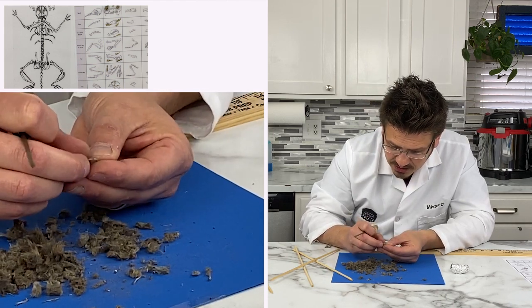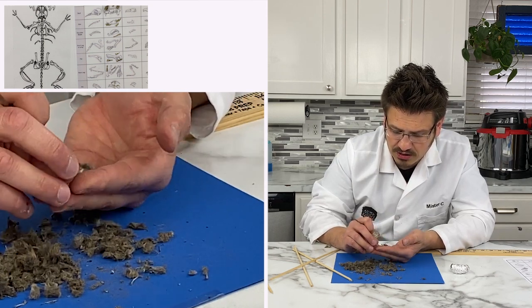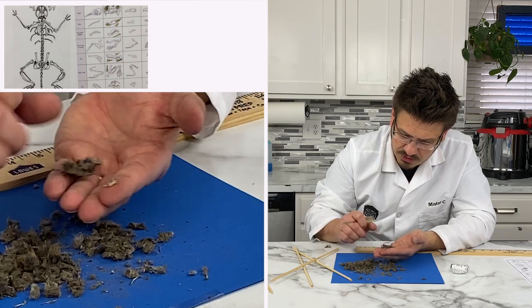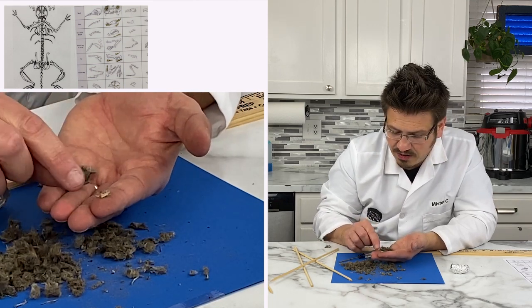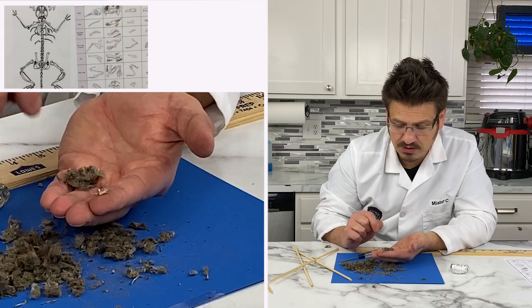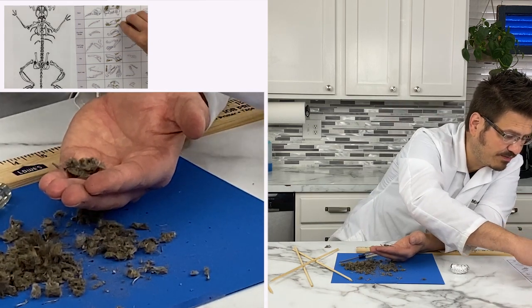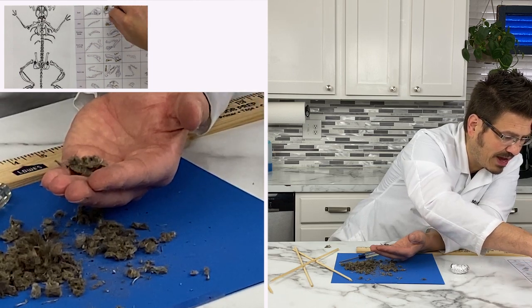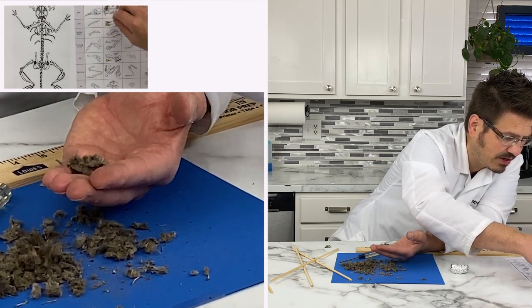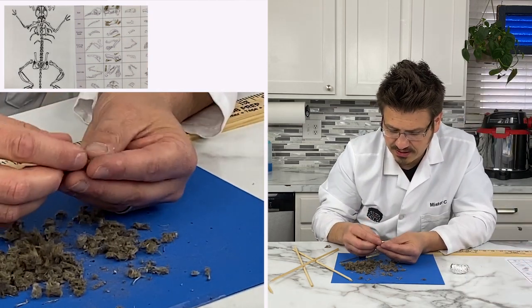What did we find here? We found the other part of our jaw. Look at that. With due diligence. So we have two skulls, and we officially have two pairs of jaws now. So we have our jaws, super cool, and they match up. So we have the bigger and then the smaller pair. How cool is that?